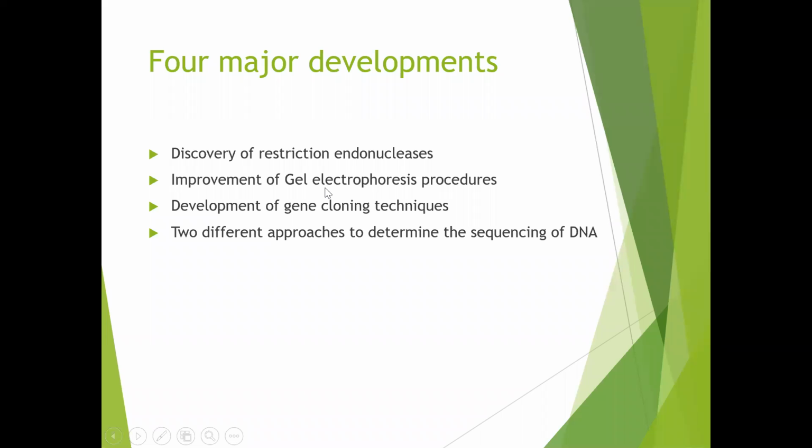The next development is improvement in gel electrophoresis procedures. We have now improved gel electrophoresis procedures to the extent that 2 nucleotide fragments which differ by just a single nucleotide can be separated by these gel electrophoresis techniques.